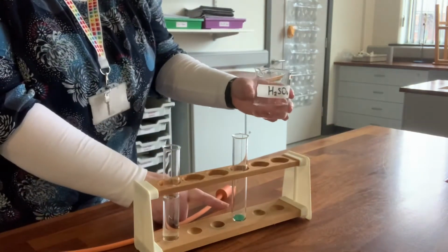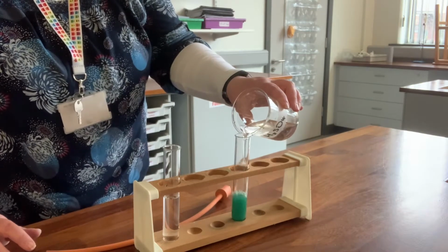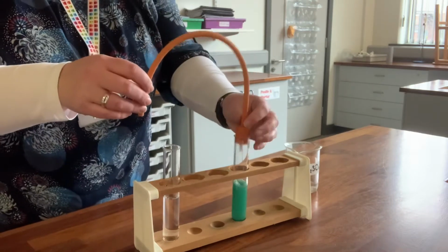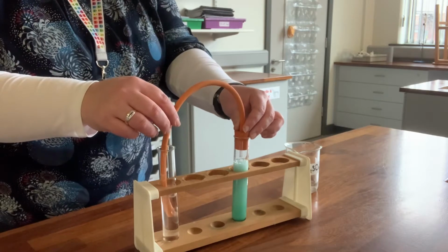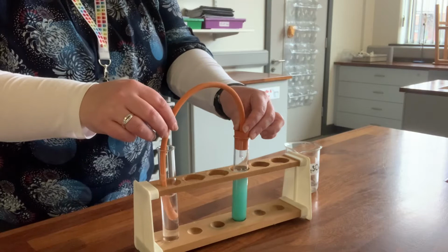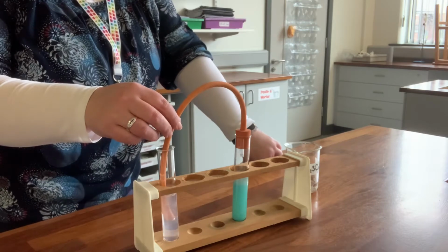So we start off, we have a green powder and we have a colourless liquid. When we add the liquid or the acid to the copper carbonate, we will observe fizzing or bubbles. I can hear fizzing, you can maybe see the bubbles. We then pass the bubbles that are being produced into the lime water, and we can see if it turns cloudy, that proves it's carbon dioxide. And hopefully you can see the lime water starting to turn cloudy already.